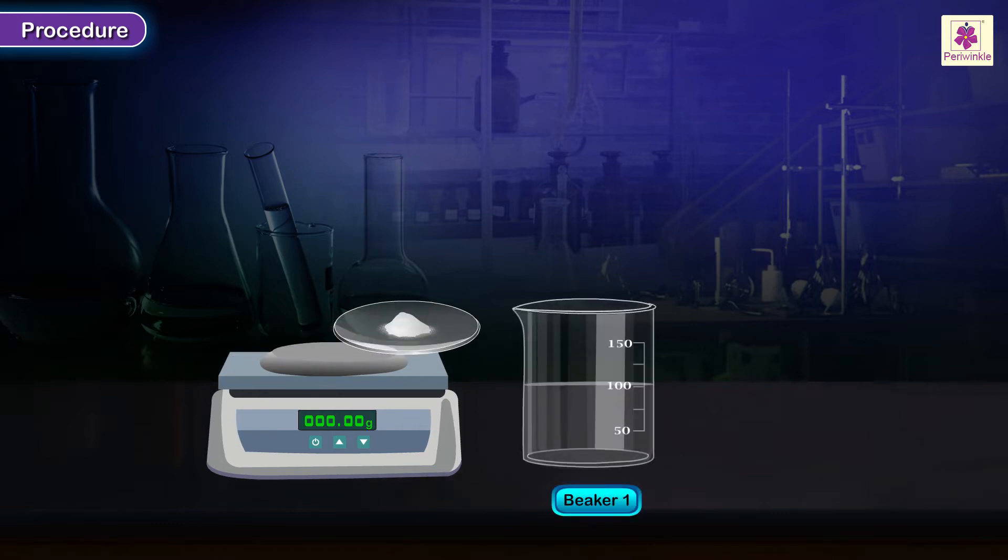Dissolve this barium chloride in 100 ml of distilled water in one of the two beakers.